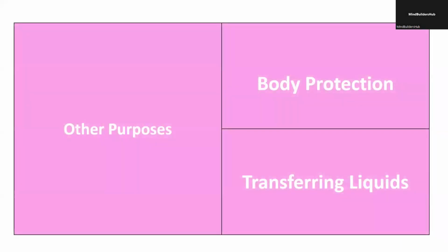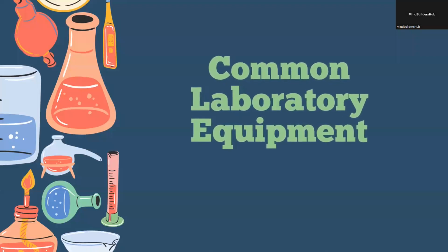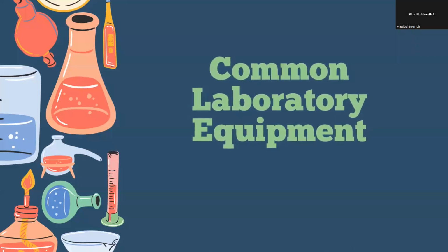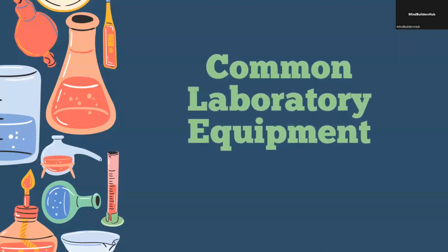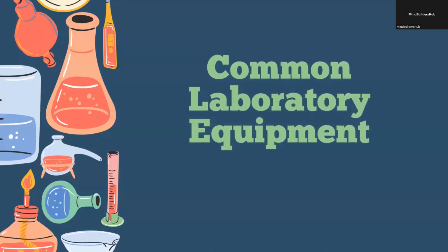Now, if we want to classify them according to their function, you may just place it here in the other purposes, for body protection and for transferring liquids. And now, in this discussion, I guess we really unveil the story behind this laboratory apparatus, their use. So once again, let us embark on this enlightening journey together.